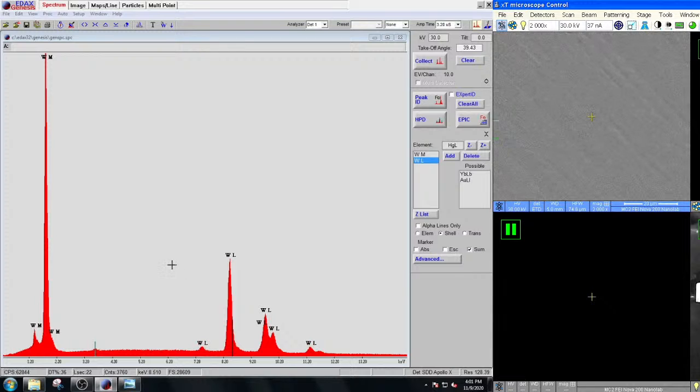Counts per second, which means that's because the photons are coming in as discrete particles. The detector is going to open up its window, which is all electric. It's not really like a shutter or anything, but the detector opens itself up to... Sorry, there's someone knocking on my door for a second.